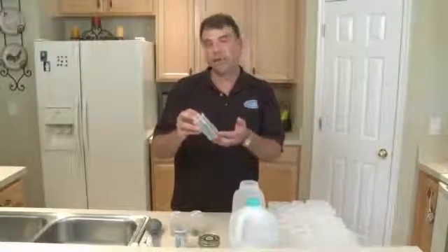This is my favorite California redwood. This plant is about six weeks old from when we planted it, and if you can see the many small branches coming out, this started as one of those and is now 12 or 13 new plants.